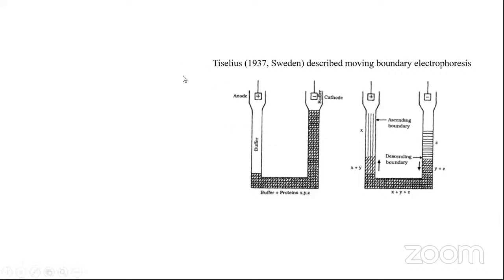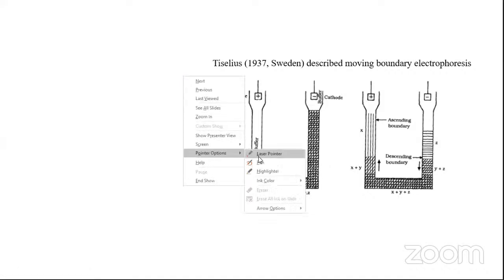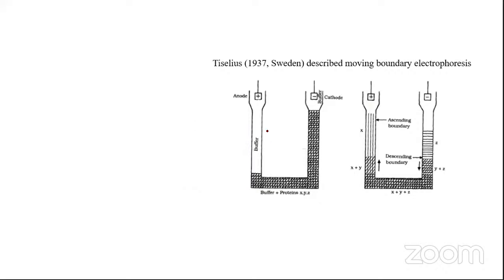What you do is try and find out whether there is any boundary formation. That is done by using certain optics, interference optics. There is a detector, there is a laser source, and a continuous laser is reaching the detector.